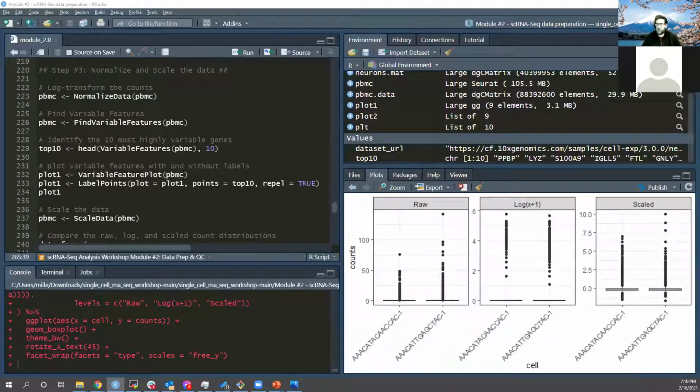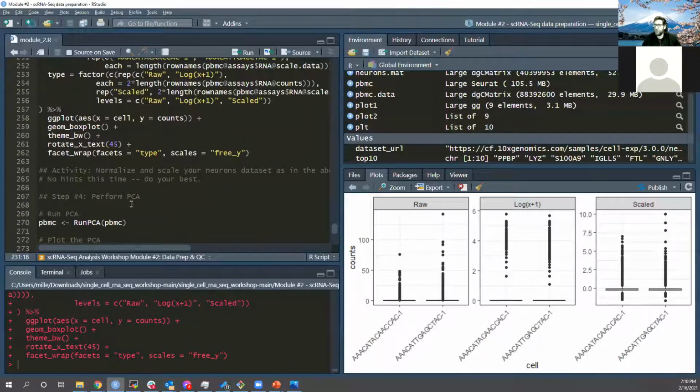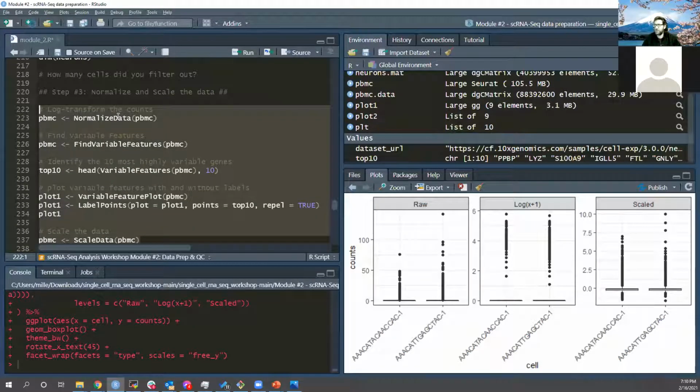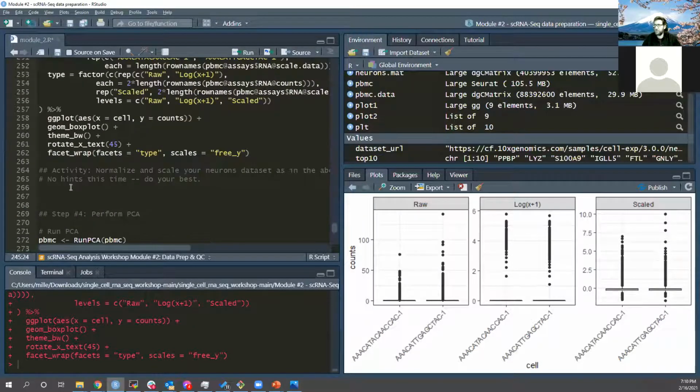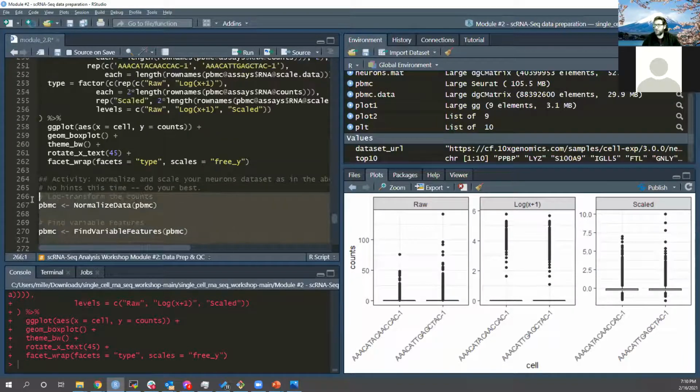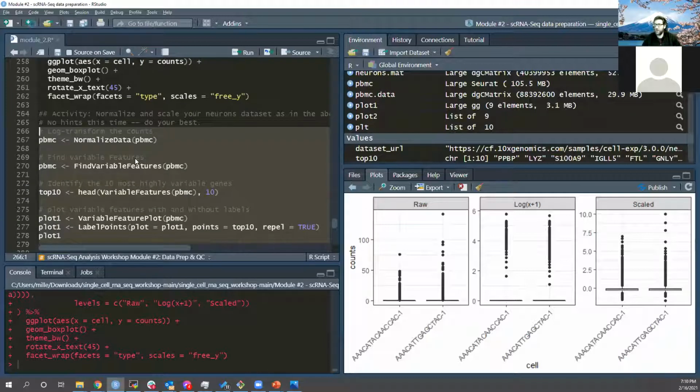Okay, so let's go ahead and jump back in now. Hopefully you took my lesson from last time to heart, and you learned how to use the laziness inherent in all of us to become a more efficient bioinformatician. All right, copy and paste the whole thing. And if you didn't know how to do this, you're about to learn.